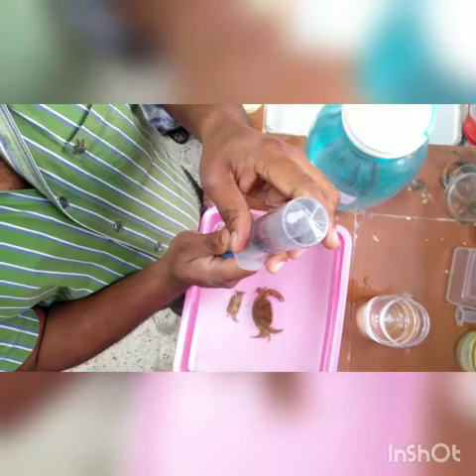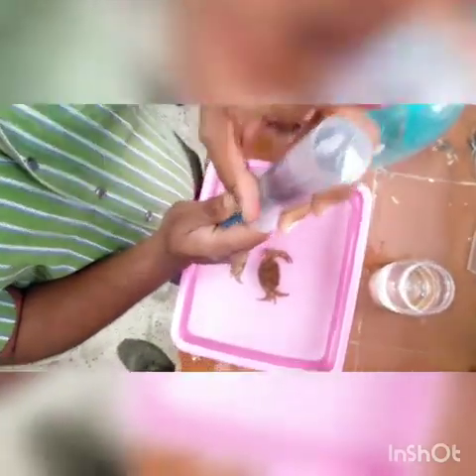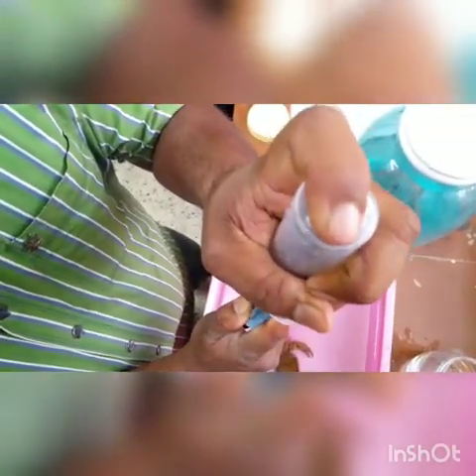Now you can try it twice or thrice. All air is removed — now it is fully in the preservative. It requires more strength; it depends on the size of the animal.